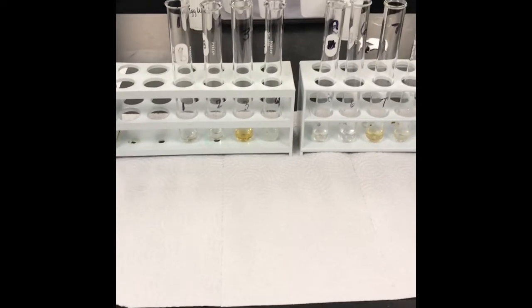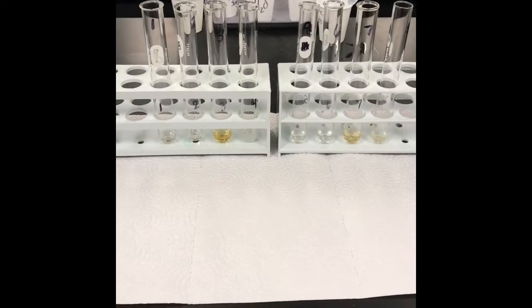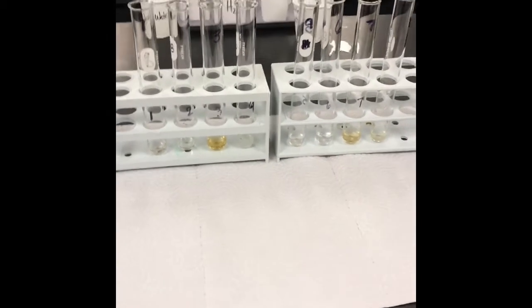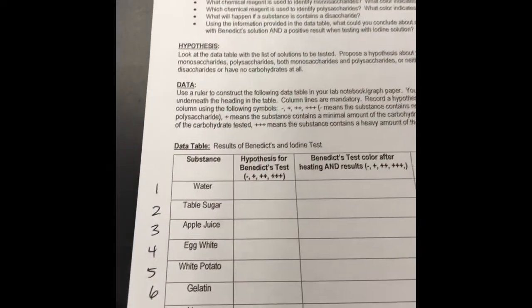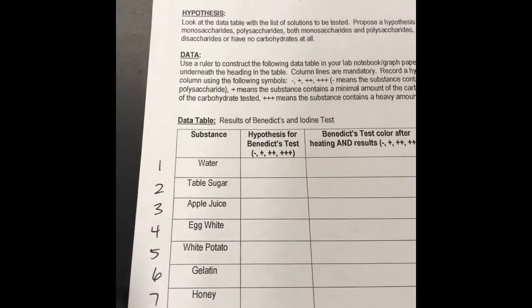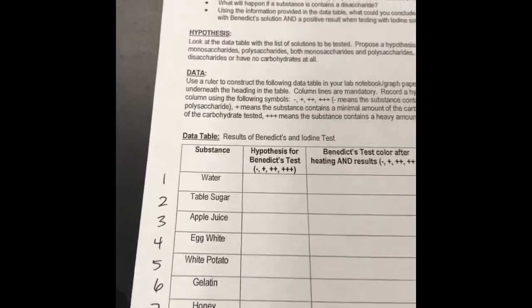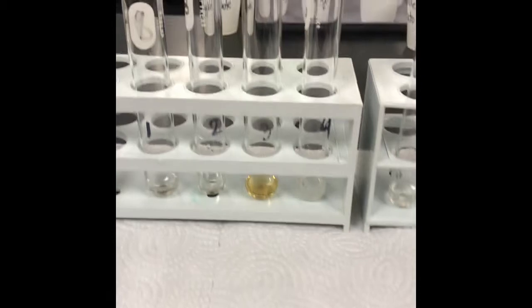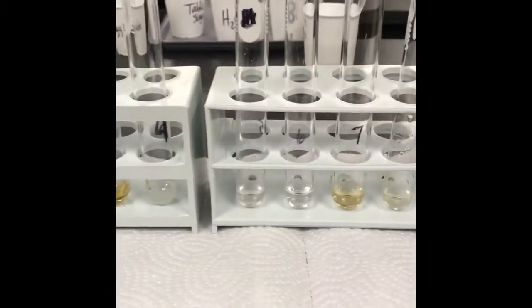We are going to perform part of our biomolecule lab today. Today we're going to test for carbohydrates. And so we are dealing with some substances today that you see on your lab sheet. You should have downloaded this. I've numbered mine, as you can see over here on the side, 1 through 8, so you can correspond those substances with what I have in the test tube. I have already loaded the substances into the test tubes.